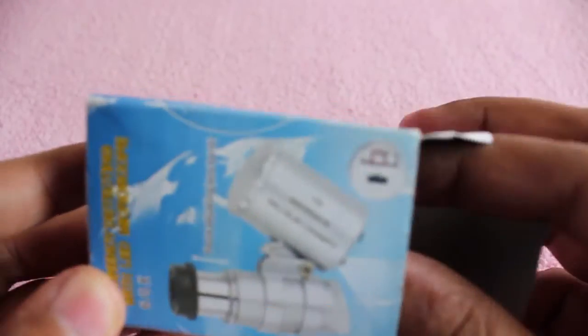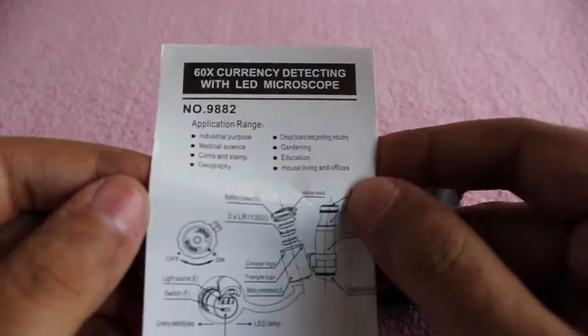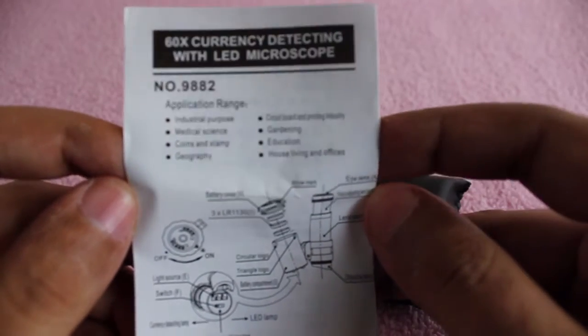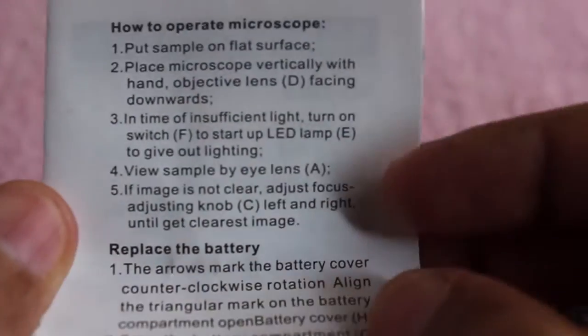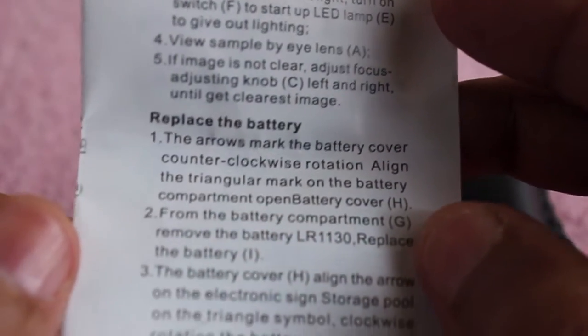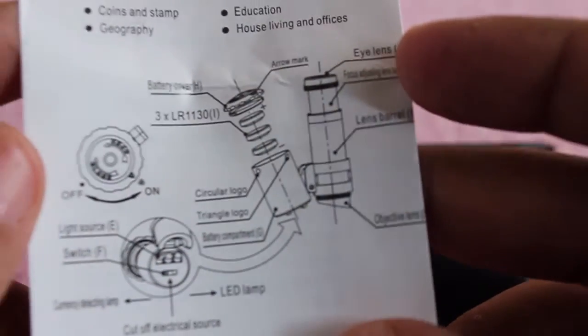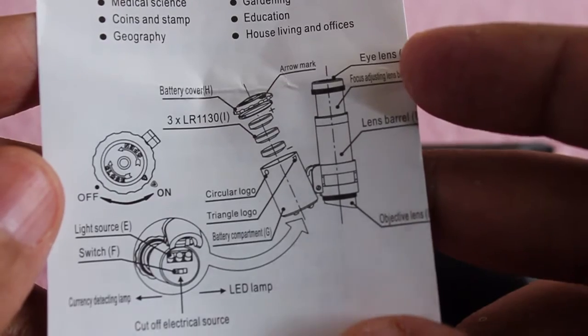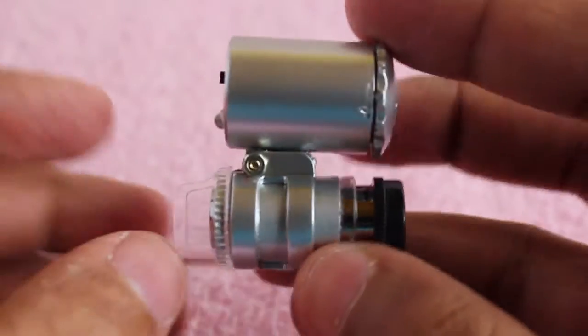For that you get a small microscope with a manual that has all the details on how it works. It runs on three small watch batteries, and those are the details of the batteries and the actual device — as you can see, it's quite portable.